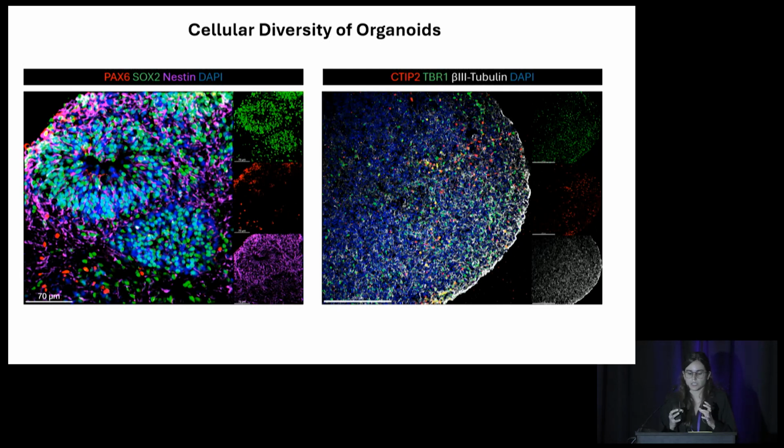This is a process that happens during neurodevelopment in the embryonic stage, in the fetus, right? So these rosettes, we induce the formation of them, but once they are there, they will evolve by themselves, spontaneously. They show up by themselves, and what I can tell you about them, in this first image, in green, we have SOX2 positive cells. You see that these green dots are mostly what you have inside of the neural rosettes, right? SOX2 is a marker for these stem cells. So inside the rosette, mostly what we have are these stem cells.